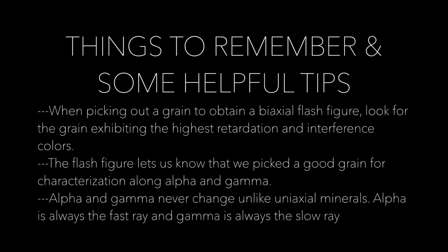Here are some things to remember and some helpful tips. When picking out a grain to obtain a biaxial flash figure, look for the grain exhibiting the highest retardation and interference colors. The flash figure lets us know that we picked a good grain for characterization along alpha and gamma. Alpha and gamma never change, unlike uniaxial minerals. Alpha is always the fast ray and gamma is always the slow ray.